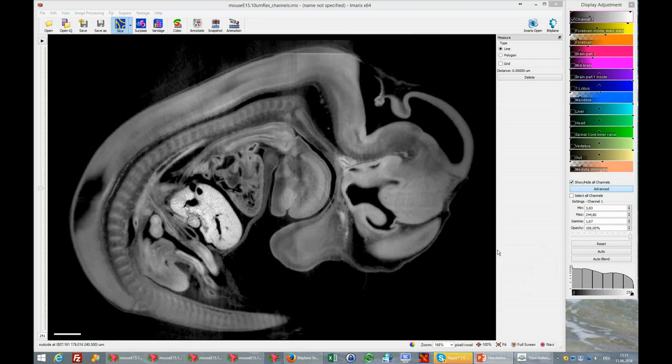The output, or where we would take over the data set, is when all this reconstruction was done, and you have a stack of orthogonal slides, normally in a TIFF format, and this you can read into Imaris. And this we see here, just the TIFF slides loaded into Imaris.